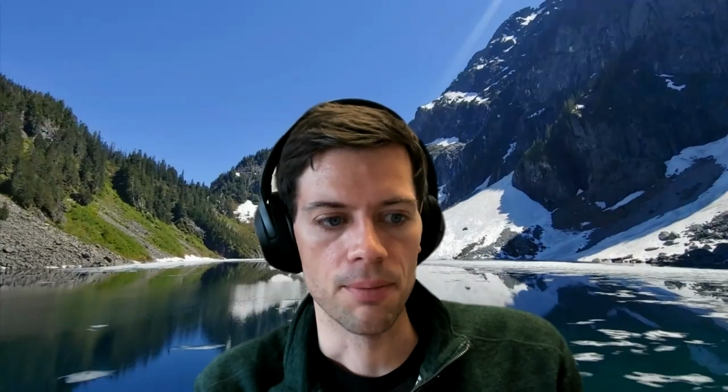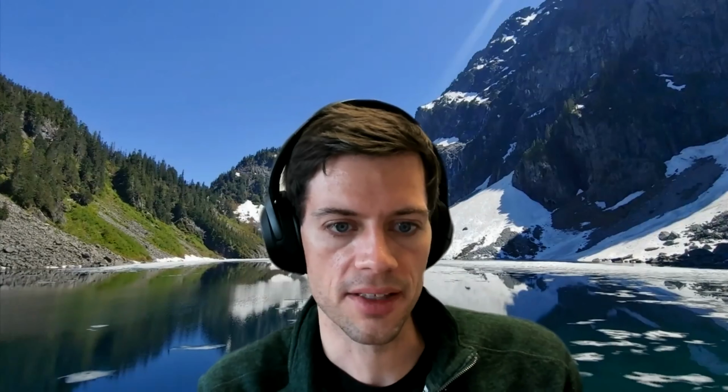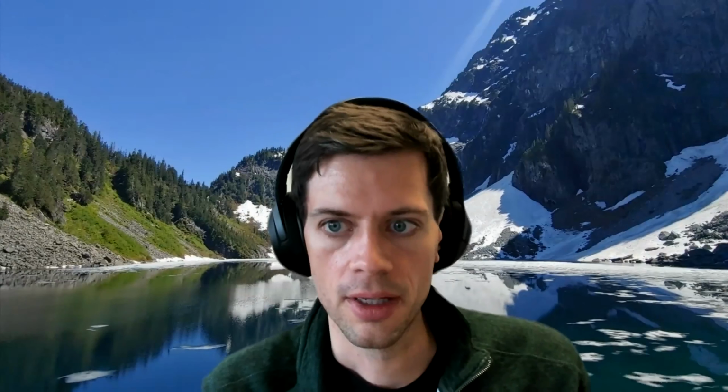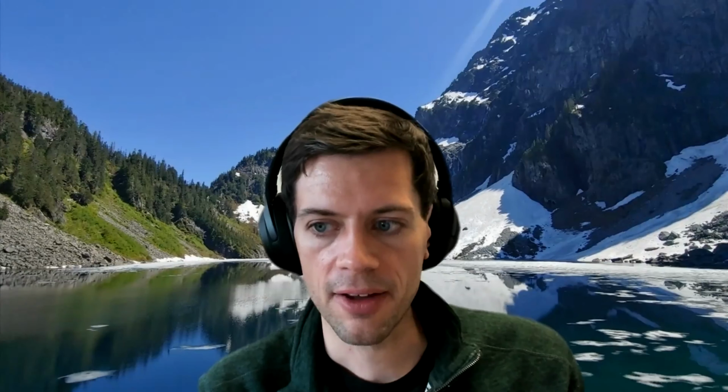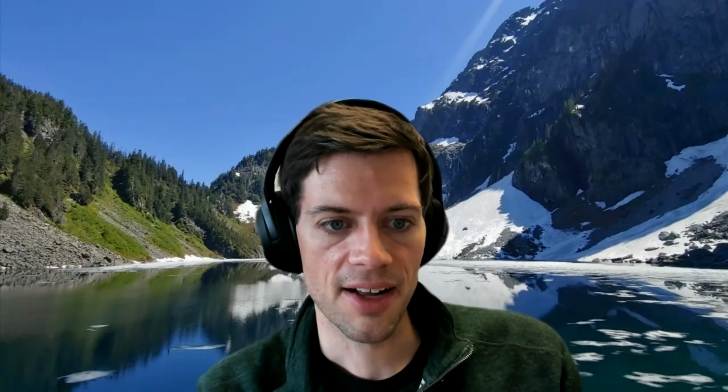What instead you need to do, and this is really important, so I just want to emphasize this really carefully, you need to think carefully about the analysis that you're trying to do and the scientific conclusions you want to try to draw from your neurons, and think about what kinds of errors would be problematic for that analysis. Let me give an example.